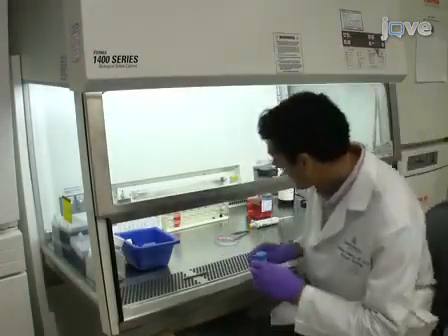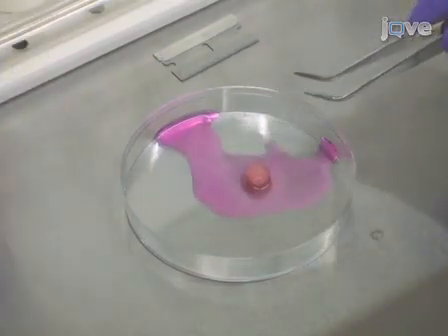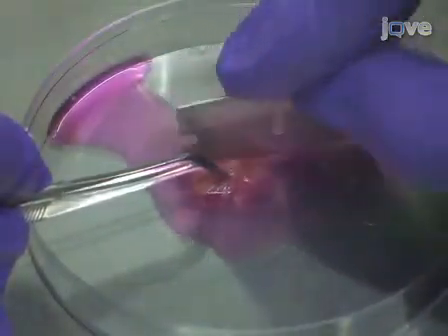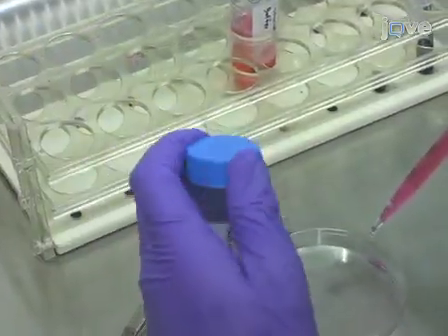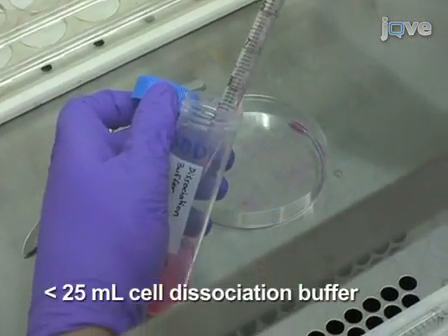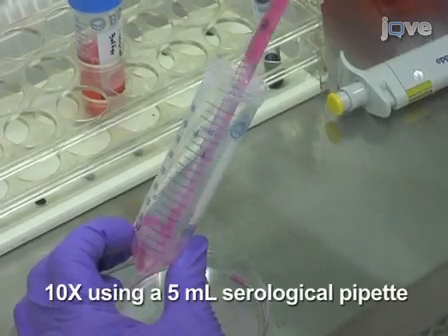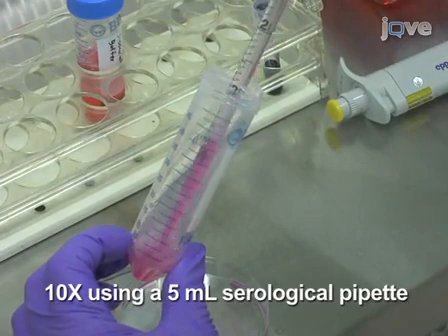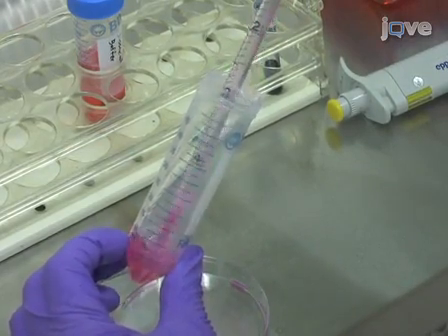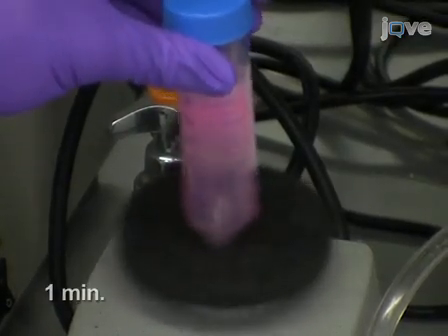Working in a sterile biosafety cabinet, transfer the tumor into a 100 by 20 millimeter culture dish containing 1 milliliter of cell dissociation buffer. Using sterile razor blades and forceps, mechanically mince the tumor. Transfer the tumor cell suspension to a 50 milliliter conical tube containing the remaining volume of the cell dissociation buffer. Next, triturate the tumor cell suspension through a 5 milliliter serological pipette 10 times. The tumor pieces should be small so that they do not clog the 5 milliliter serological pipette, and then vortex the suspension at maximum speed for 1 minute.